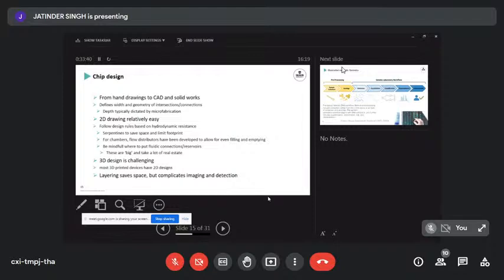So is it important what your channel looks like? Do you want to have a square channel? Do you want to have a rectangle? Do you want to have a circle? A triangle? Sky's the limit. So in the design phase, once you're two-dimensional on paper or just looking at length, life is easy. If you start thinking three-dimensional, a lot of questions come up where some of them you'll know the answer, some of them you've got no idea.